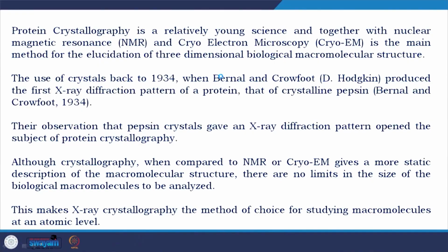A protein which is in solution would make a crystal or not. This makes X-ray crystallography the method of choice for studying macromolecules at an atomic level. You really get high resolution structure, you really get to see the molecules in real atomistic vision.